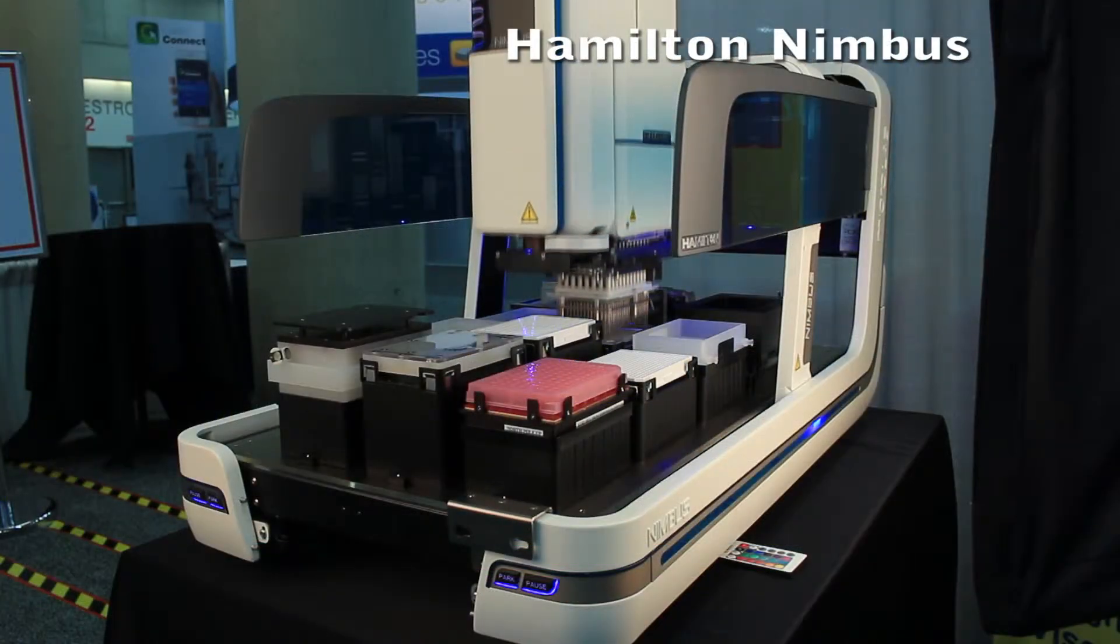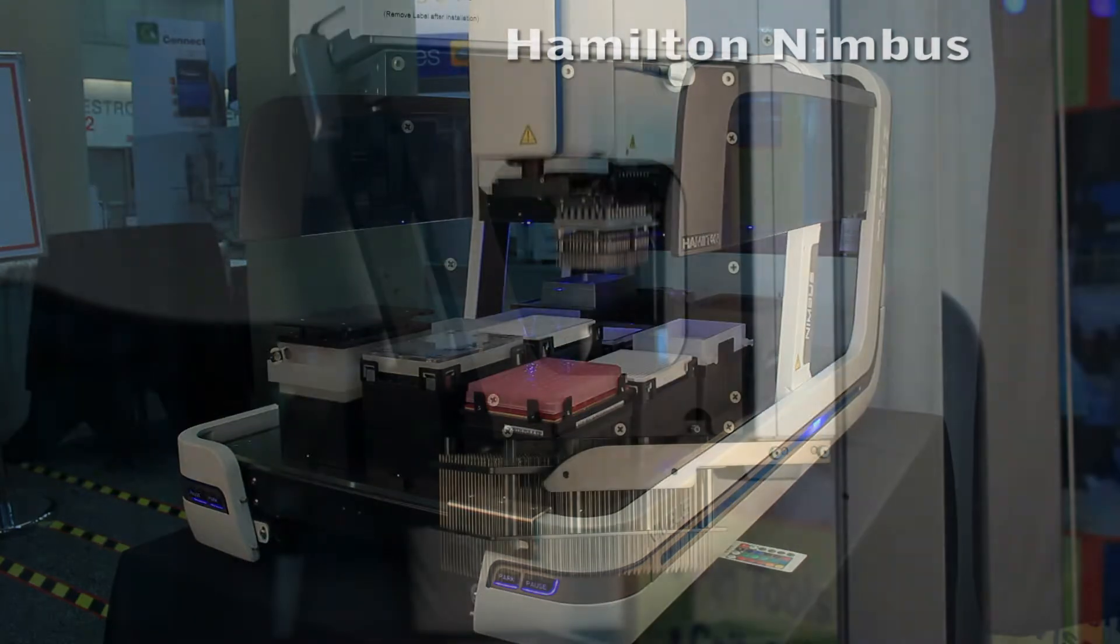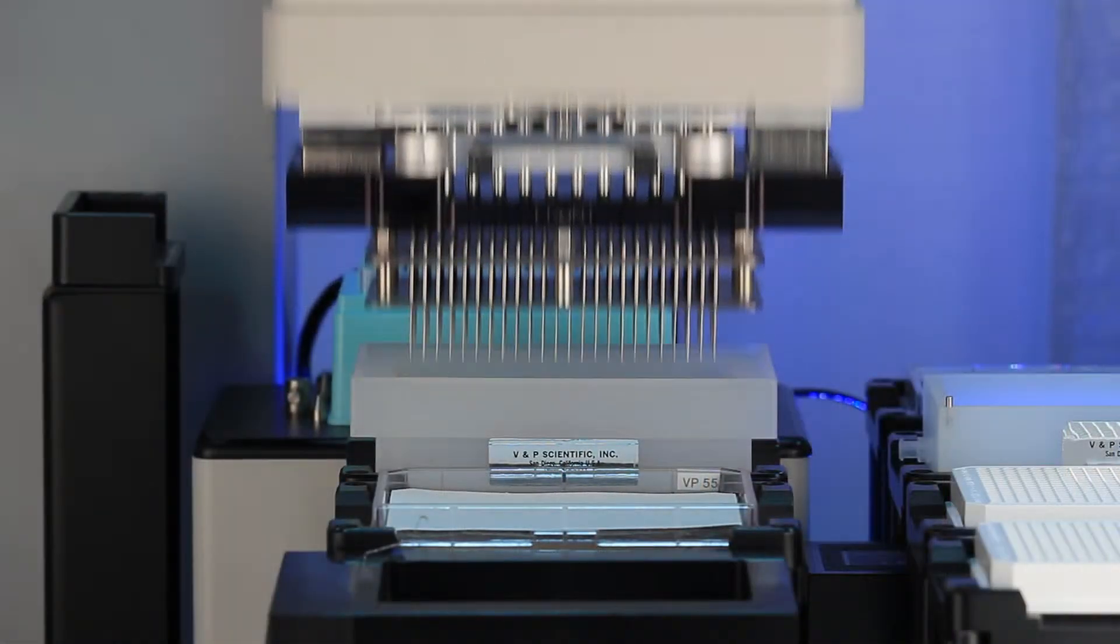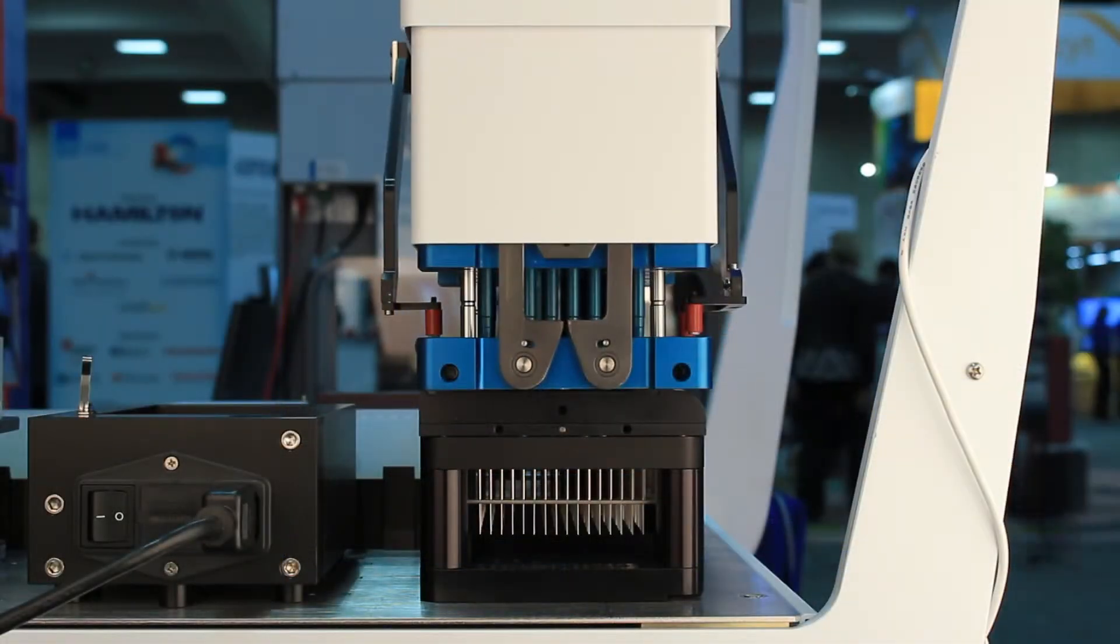DNA sample storage and next generation sequencing. With our varied line of mounting hardware, we can integrate our pin tools on any robotic pipette head. Using unique features of each liquid handler, integration is simple and fast.